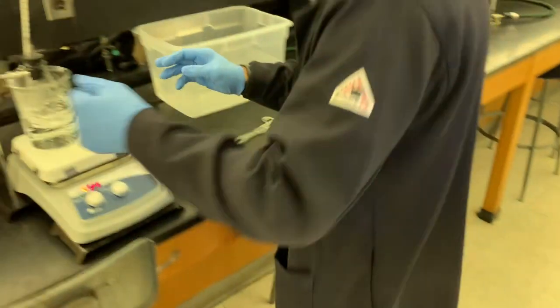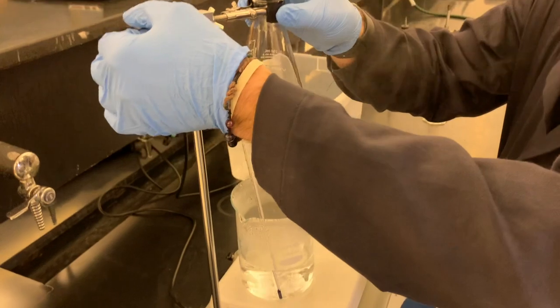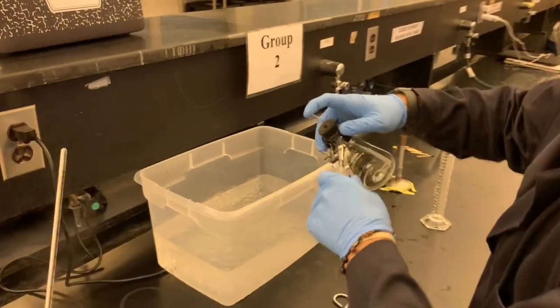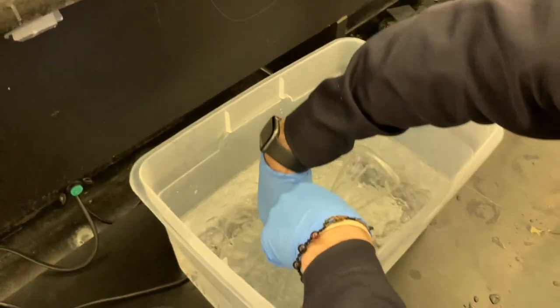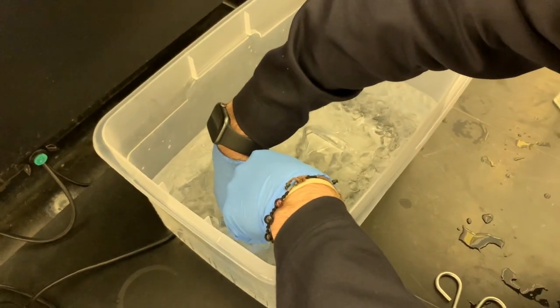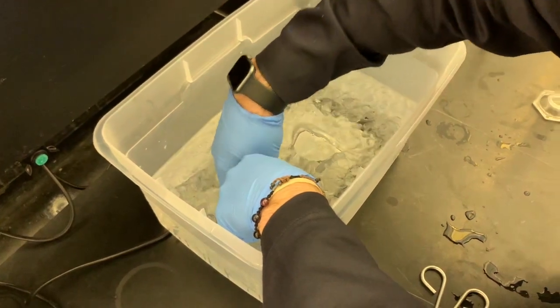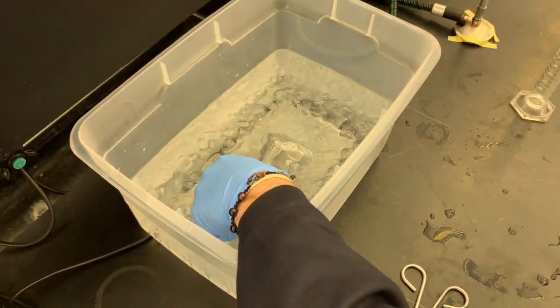And then what you're gonna do is you're going to carefully remove the flask. You're going to put your finger on top of the flask as it cools, and you're going to dip it into the ice bath. So what's important is that you don't let bubbles come out of this, and you want to cool it evenly. So once you let your finger go, some of the water will begin to automatically flow in. What you're looking for is bubbles. So if you can find a clear spot, it's always good to know that you're not going to be losing any of that gas because of, let's say, just a leak somewhere.